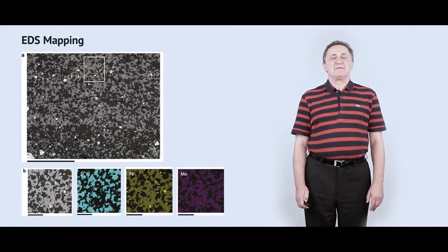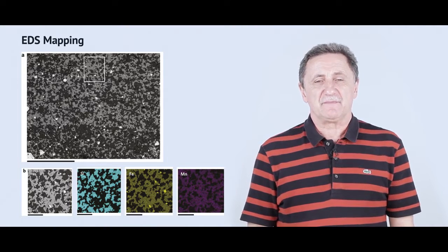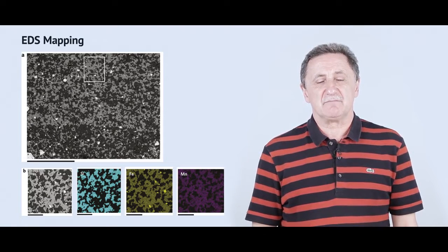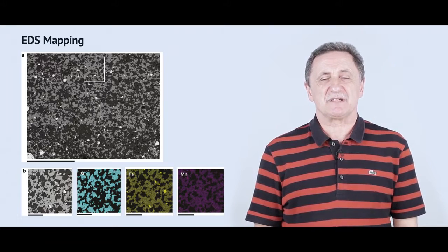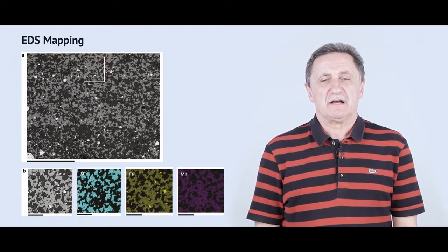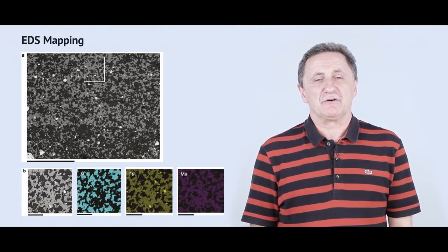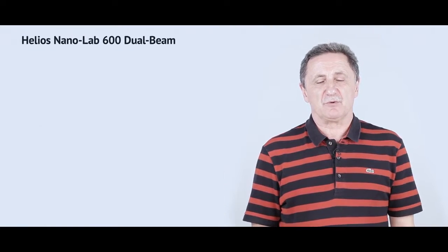Very useful approach. So let's conclude. Typical scanning electron microscopy is a very useful and powerful tool to investigate morphology, in the secondary electron mode, and phase composition in some sense, in the backscattering mode, as well as the elemental chemical composition of your material, in the EDS mode, with resolution as low as 1 nanometer for the first 2 modes and around 1 micron for the EDS mode.